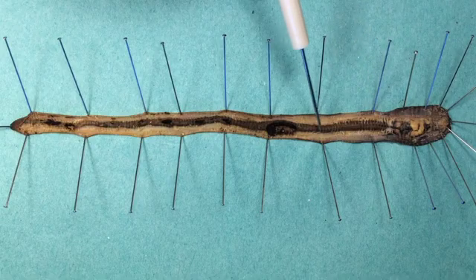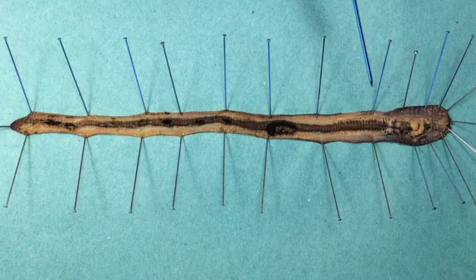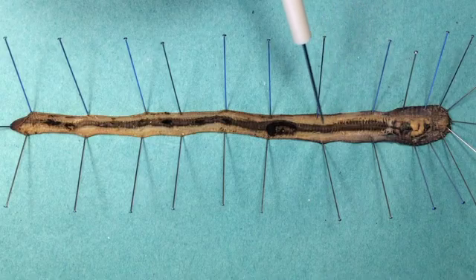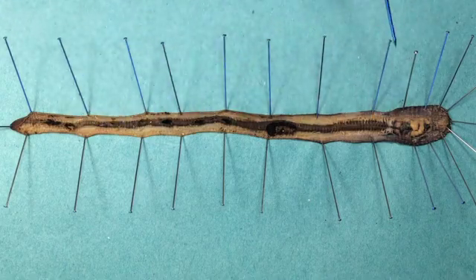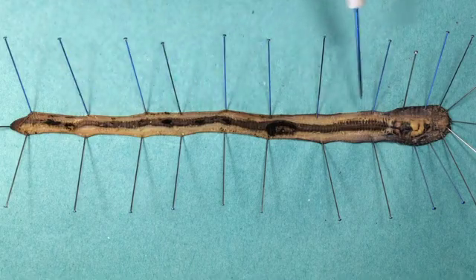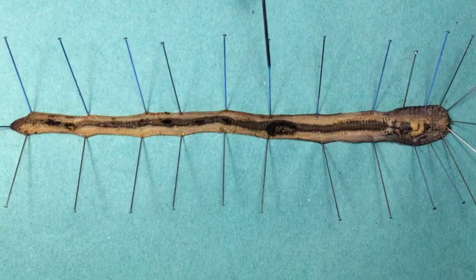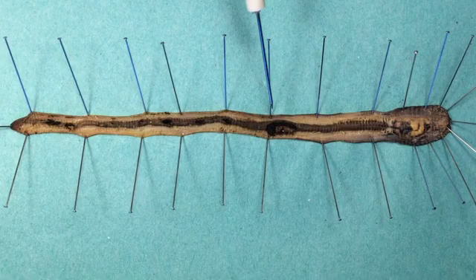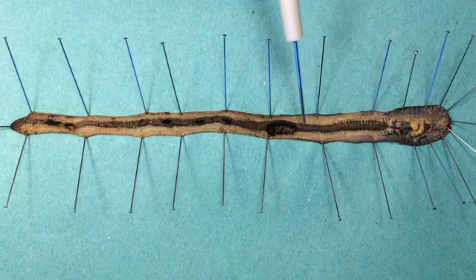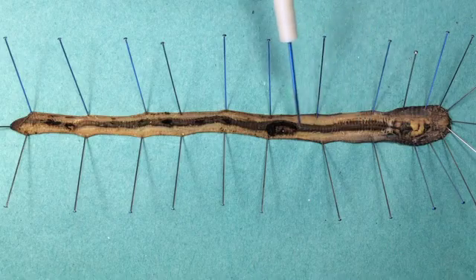Next we have the intestine, which is by far the largest part of the digestive system — this is where digestion and absorption of nutrients take place, so all of this is the midgut. You'll notice that the gut is all in one line with no coiling. Given the body shape of the worm there isn't really any room for coiling. But they do have an adaptation that increases the surface area available for digestion and absorption, called the typhlosole, which runs along the whole length of the gut and is an infolding of the intestine inside.